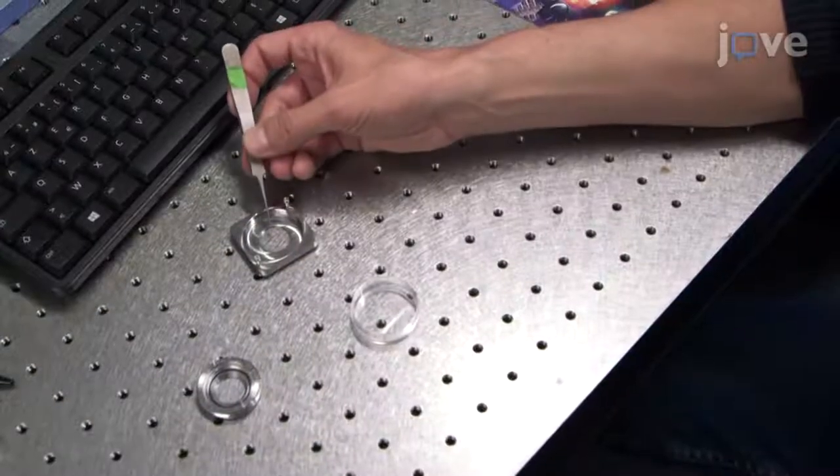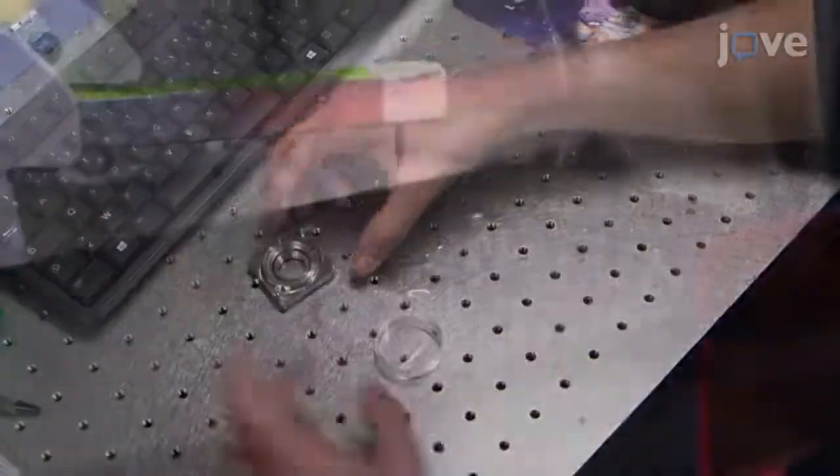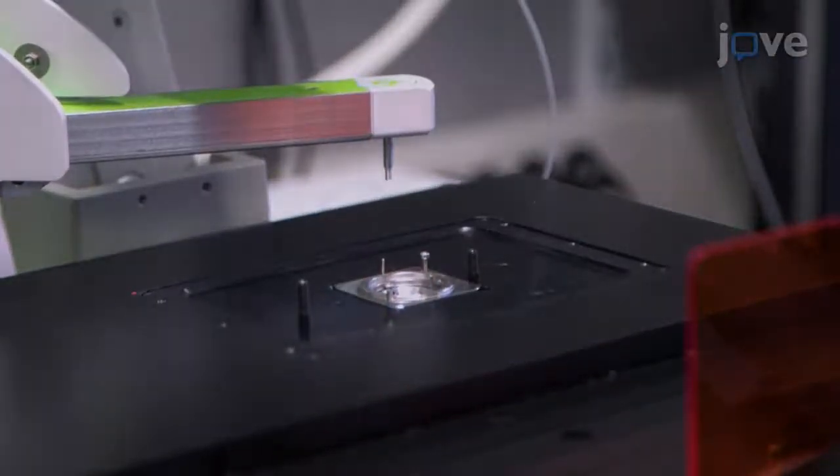For glass slide micropatterning, mount the coverslip in a Luden chamber and place the chamber onto the stage of a microscope equipped with an autofocus system.